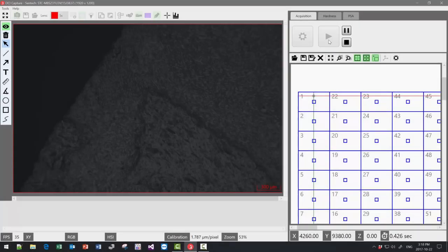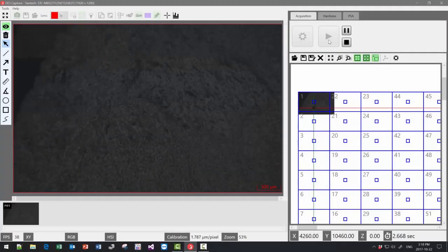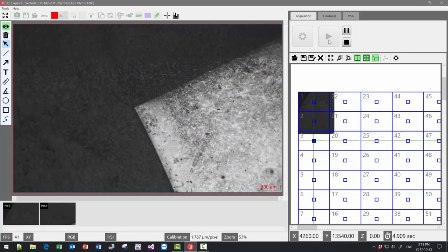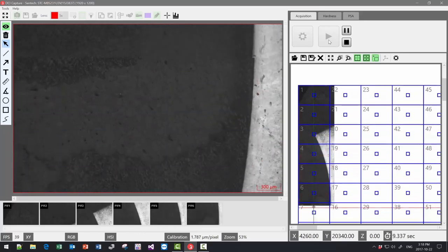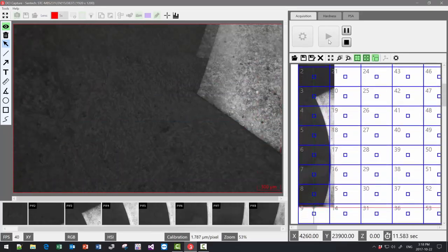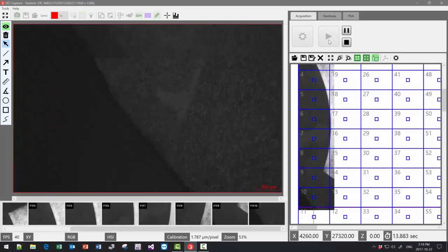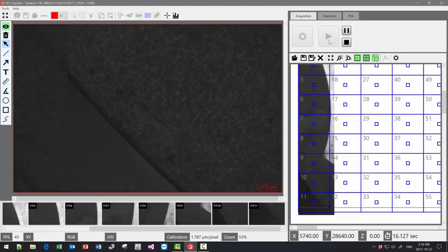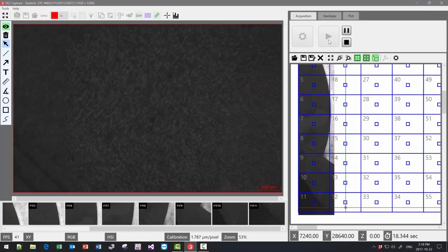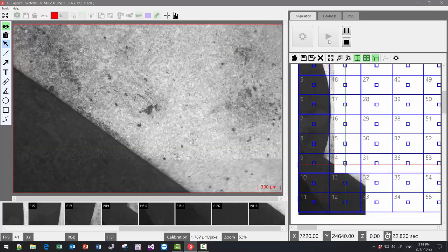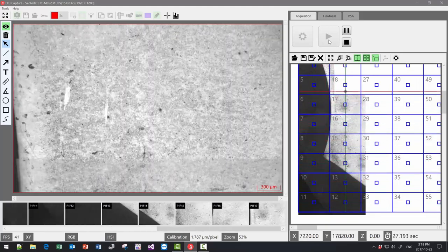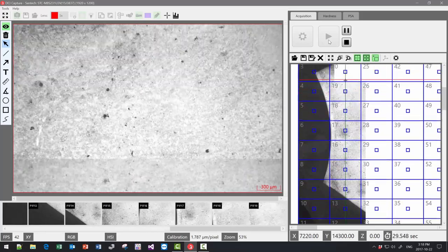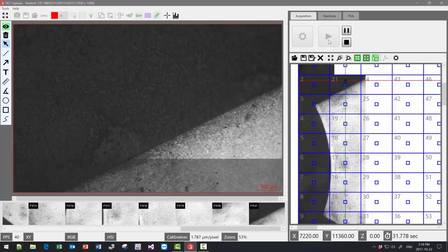Using an encoded stage increases dramatically the speed of mosaic building while reducing the sensitivity for pattern matches and uneven backgrounds when trying to stitch images from different fields.